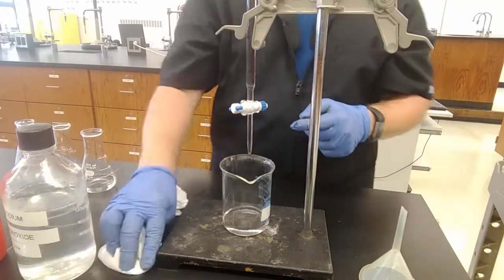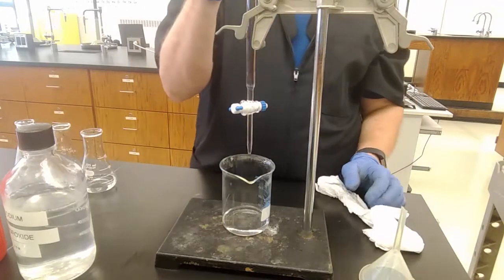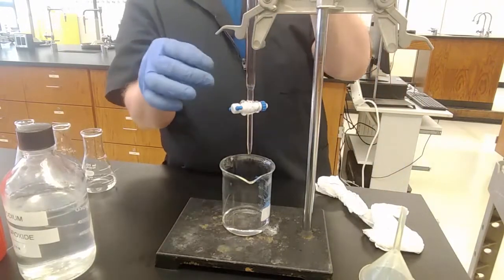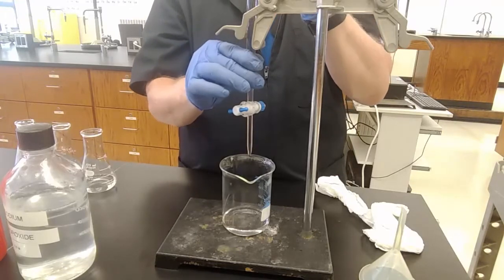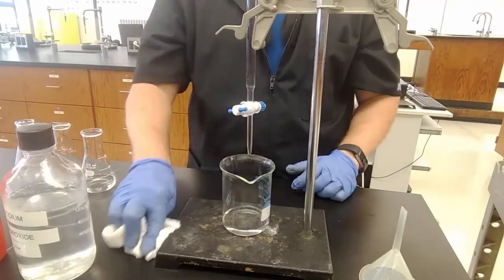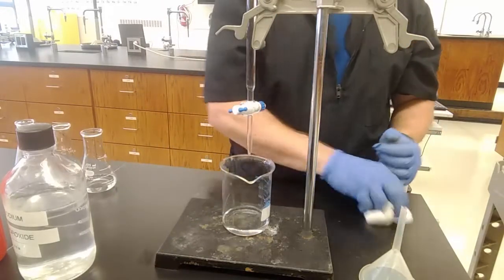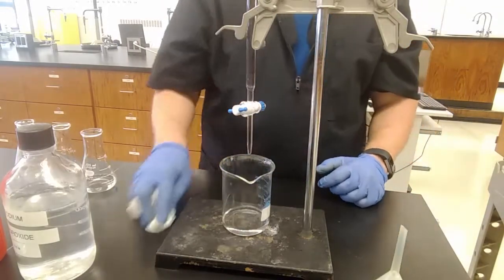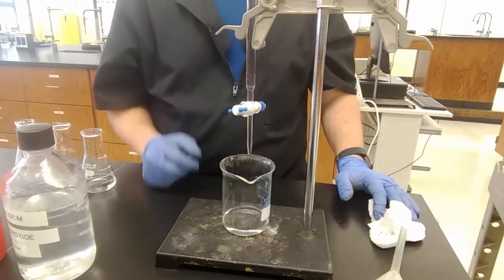The burette, like that pipette before, is a very, very precise measuring device. This is to deliver at 20 degrees Celsius. I'm looking for a plus minus on it. Doesn't have one, but it's, again, usually like 0.02 of a milliliter. Since it reads in 0.1s of a milliliter, and you're guessing that last digit, pretty much plus or minus 0.02 or 0.03 milliliters. Very, very precise volume measuring.